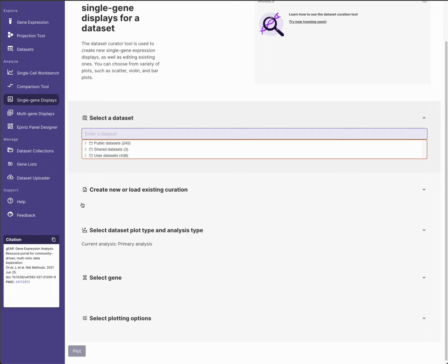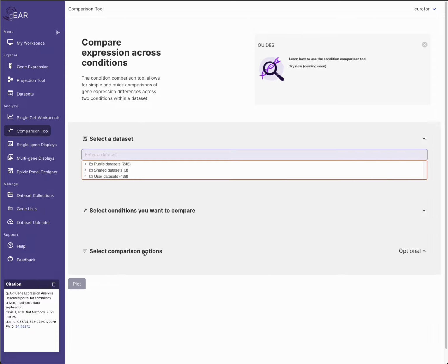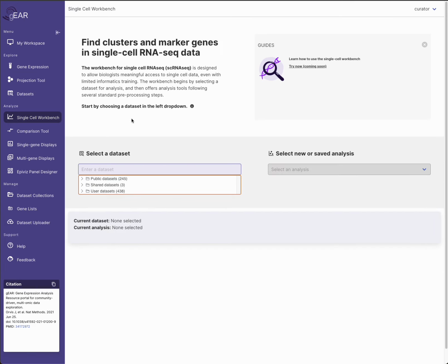And these menus actually are very similar between each of our analysis modules so that you can be more familiar of how to work through them, and it's not learning each tool individually and also learning its styling. You already know the styling, you just need to know how to utilize the tool.